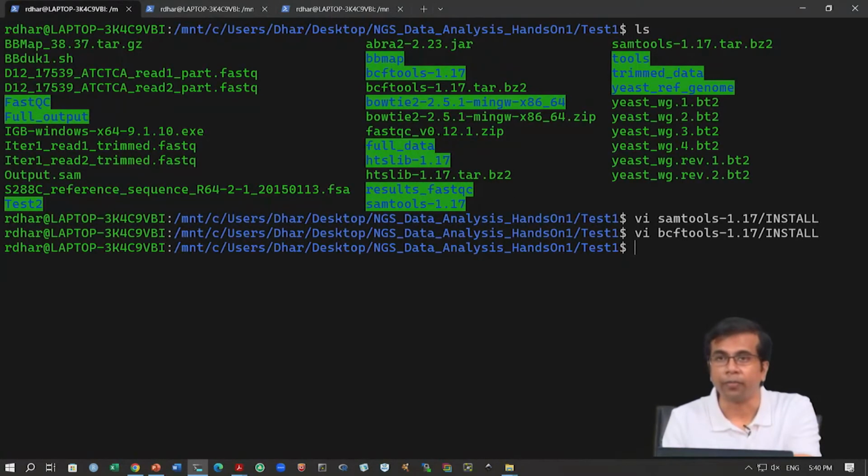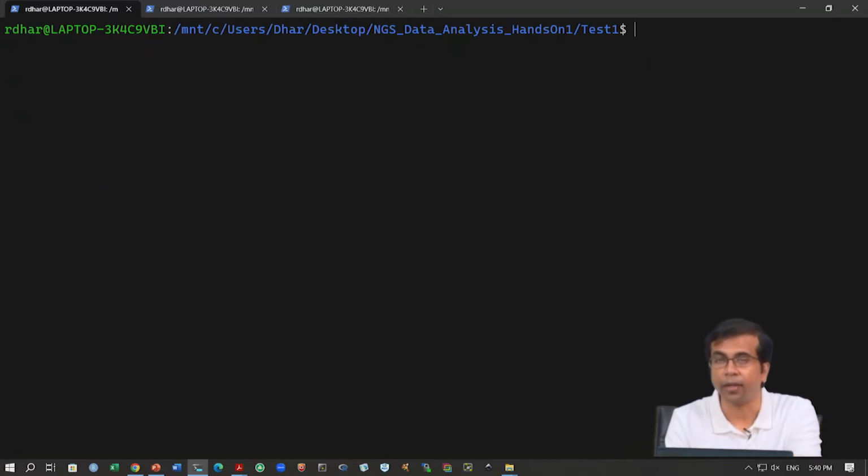I hope that clears up how to install these tools. There could be some errors that you will probably notice. This is something that might happen, and there are workarounds for those problems. If it is simply a library missing, you can install those yourselves. Now we can move into the analysis part itself, after we have done the installation.